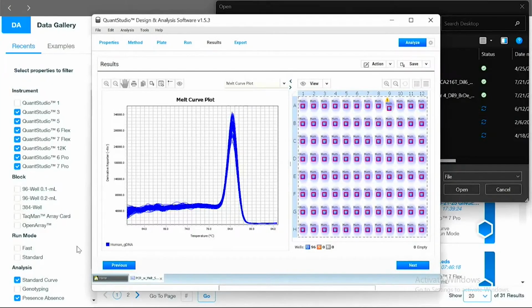If you were to take a Sharpie and go across the plate surface, we would see that. And I have an example of that if you want to see it in another presentation. If you need to write on the plate, which everybody wants to do, I do it, other people do it, just make sure it's on the edges or away from the actual well itself, or it can bleed in.